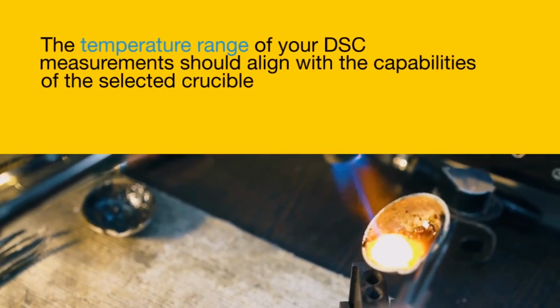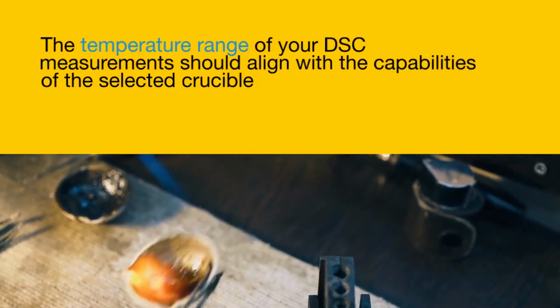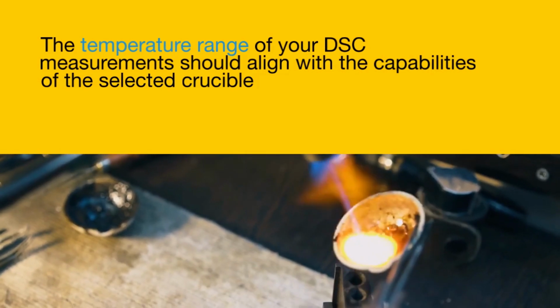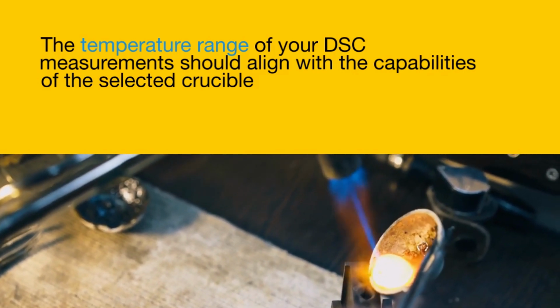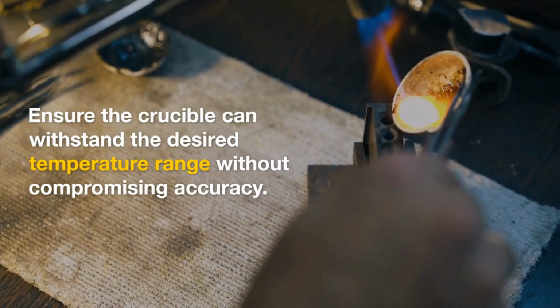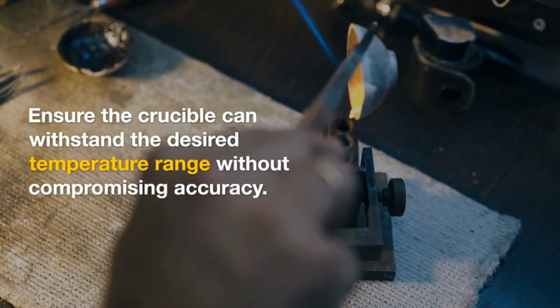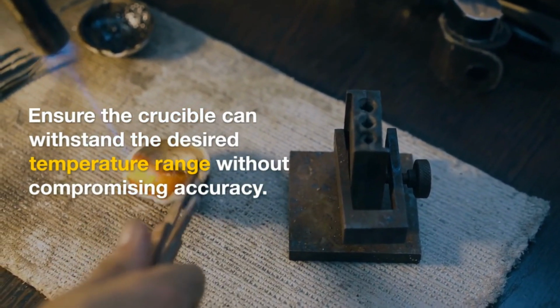The temperature range of your DSC measurements should align with the capabilities of the selected crucible. Different materials have different melting points and maximum operating temperatures. Ensure the crucible can withstand the desired temperature range without deforming, reacting, or releasing impurities affecting measurement accuracy.